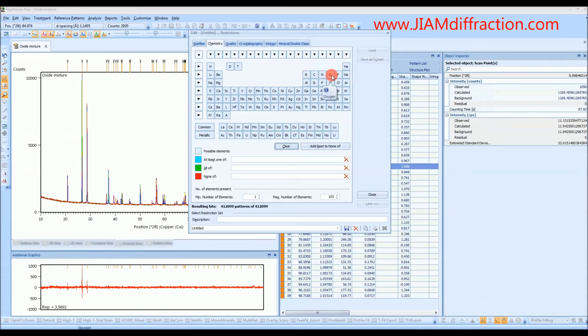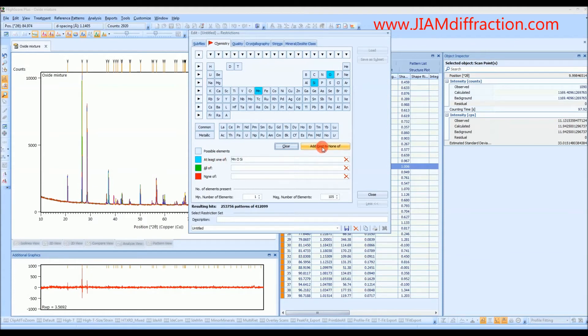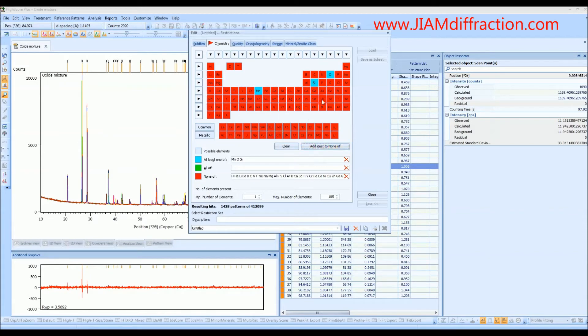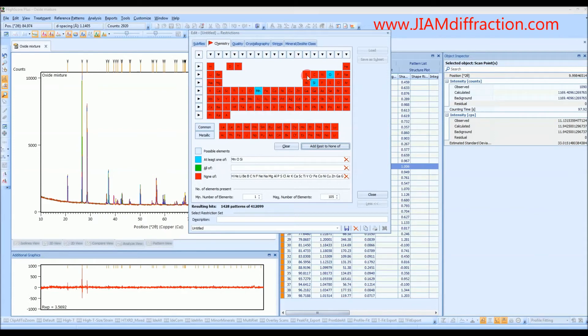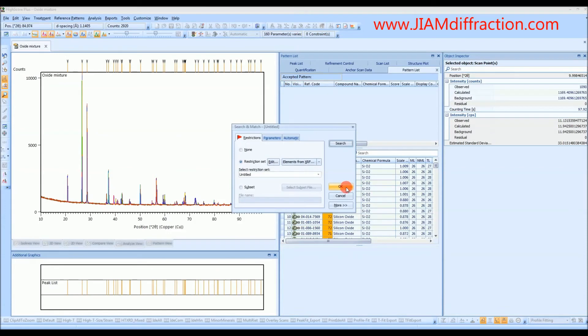So in this case I know that I made a sample that had manganese oxide in it and silicon oxide in it. So I will just choose these three as possibilities, or at least one of, and I will add the rest to none of. So now we will ignore anything in red, any pattern that has an element in red, and only search through patterns that have manganese, silicon, or oxygen in them. And we see that we have 1428 patterns. So I will close in search. But we see that the search match is done so we need to make sure that we say OK.